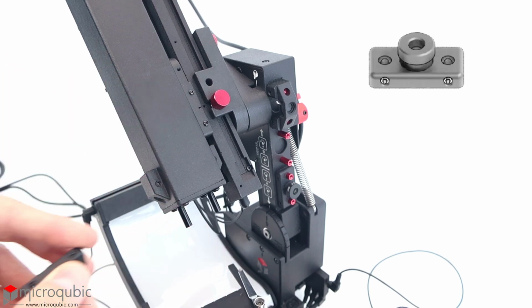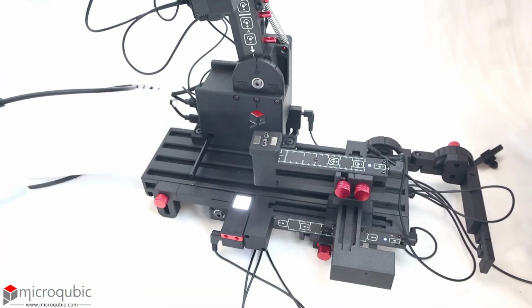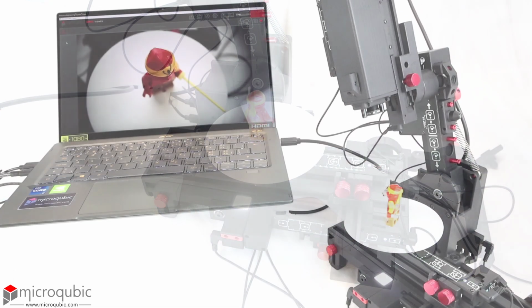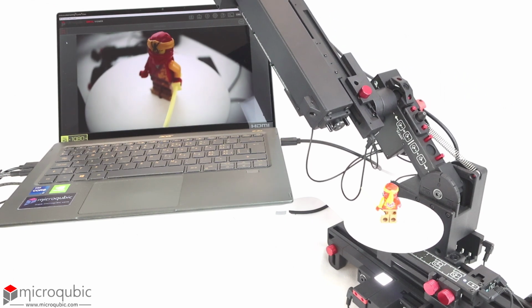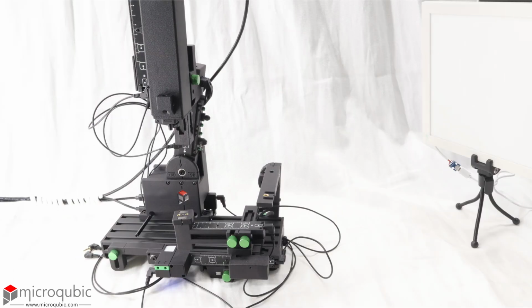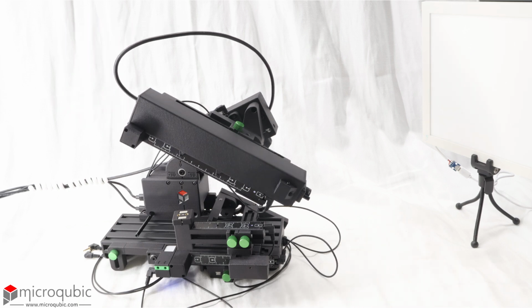Finally, the microscope's wide-angle objective lens can be used to observe larger objects that cannot be imaged using traditional microscopes. Different light sources and custom-designed and 3D printed sample chucks can be used depending on the sample type and the imaging mode. Because such macro objects require a larger illumination source, you can also consider lights and softboxes used in classical photography. And thanks to the system's dual-axis tilting mechanism, you can even image objects placed outside the microscope's main body.